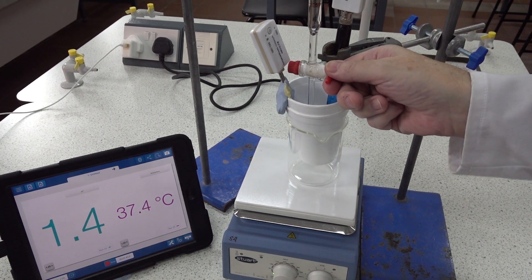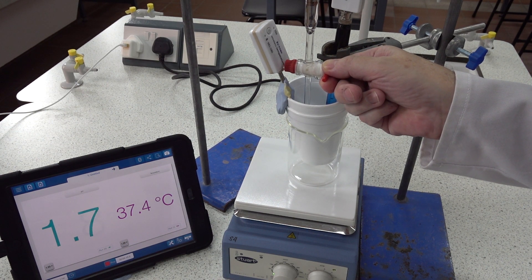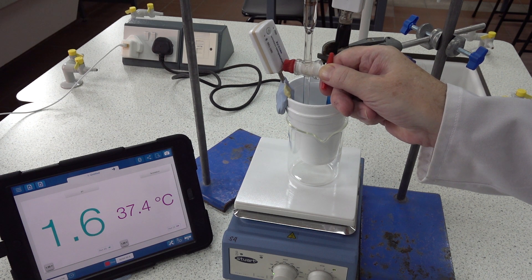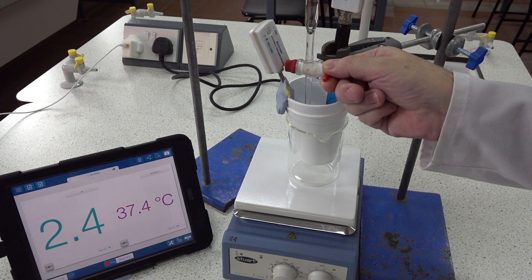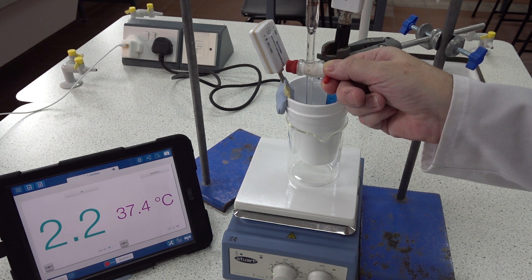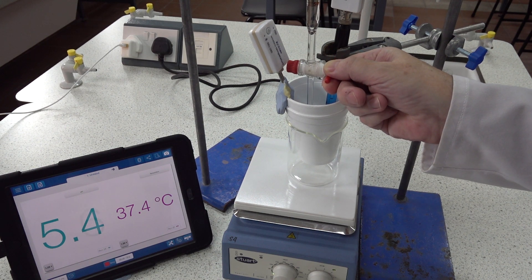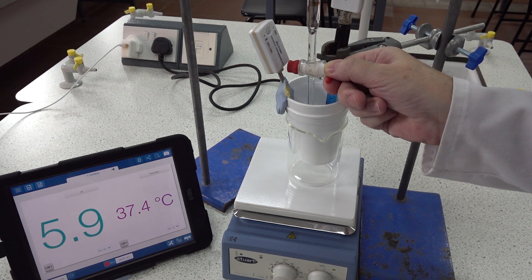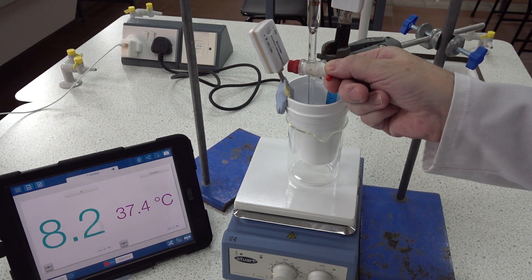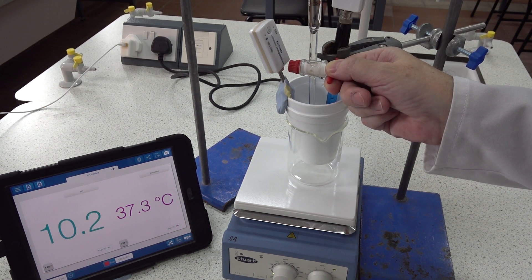Let's add 0.2 cm³ at a time if we can. So this is 25.5. Twenty-five point eight. Twenty-six. Twenty-six point one. Twenty-six point two, twenty-six point four.